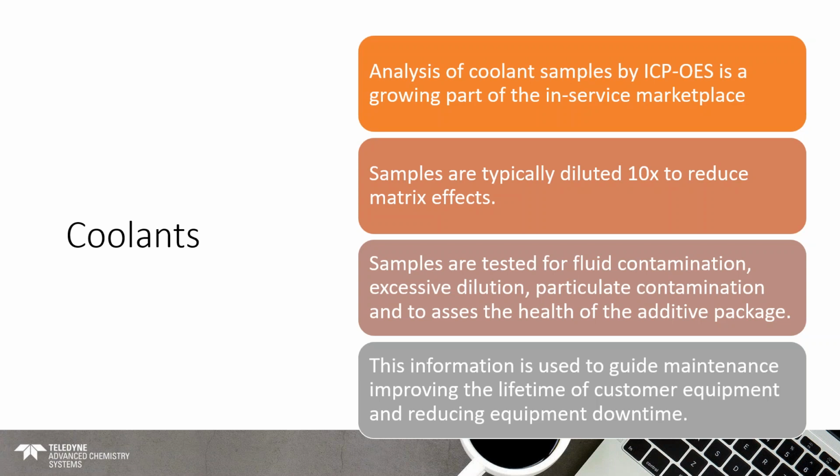So the things they test for here: fluid contamination, did something else get into my coolant; excessive dilution, have we poured in too much water; particulate contamination; and also, like I said, to assess the health of the additives. And the additives are elements that are added that really help the coolant perform the way that it needs to, and those can wear out over time. This information is used to guide maintenance to improve the lifetime of the equipment and to reduce downtime.